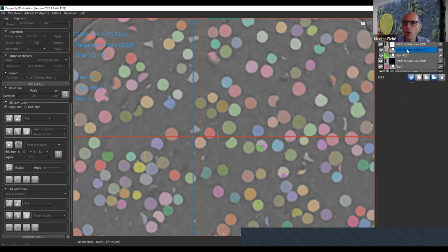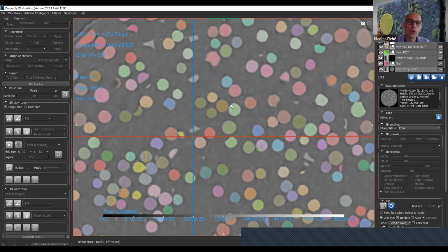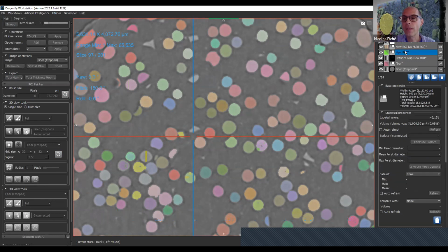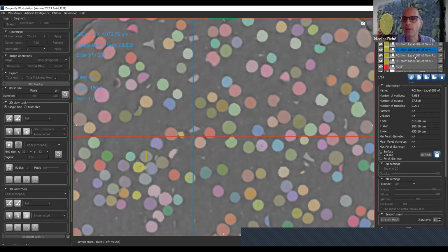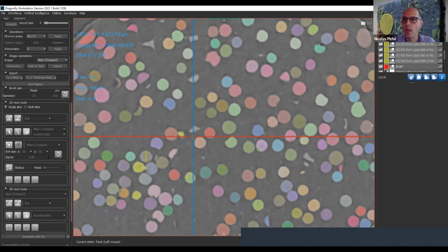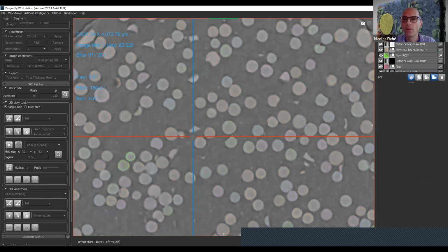Okay, so we were on the grid. We saw what we can do with a ROI and multi-ROI. There's a ton of other stuff that you can do on a ROI, for example. Let's say that I convert my multi-ROI as one ROI. I will kill a couple of objects that are taking too much space. I will make a ROI, which is the mask.